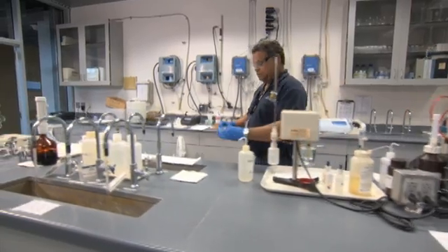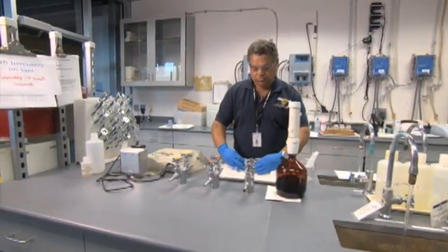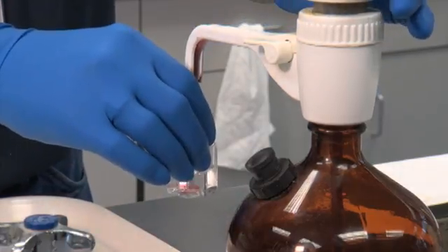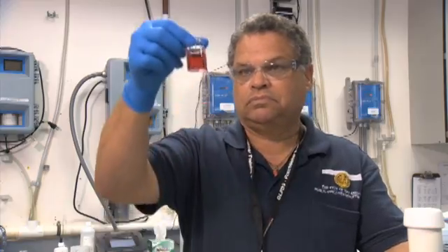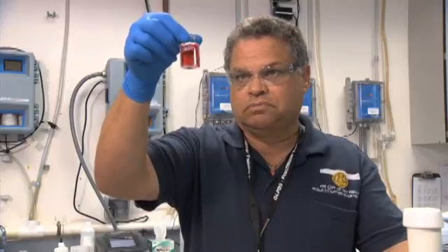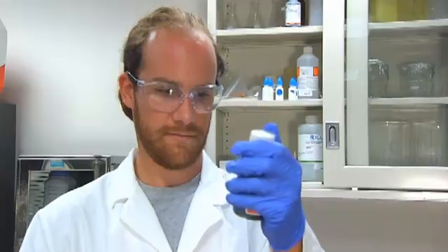When it comes to chemicals, it's a good idea to treat every chemical you use as hazardous. Never inhale, ingest, or touch a chemical with your skin. Use required PPE and be sure to keep chemicals separate from each other until you are ready to perform a lab procedure. To understand the potential hazard of lab chemicals, look at the label.